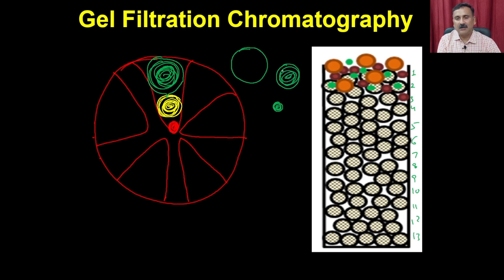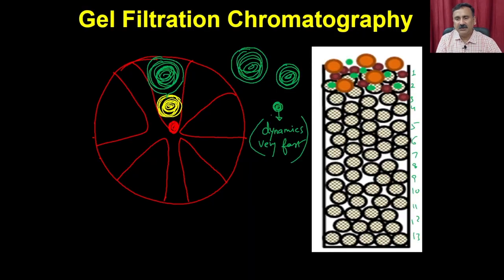Now, when these three molecules are competing with each other, they should run fast. The small size molecule is very small and also lighter in terms of particle, so its dynamics are going to be very fast. It's like entering a cinema hall to capture seats in the first row: the smallest boy is going to run very fast and capture the seats in the first row. So the smallest one is going to capture the initial rows and fill the inner part of the cavity.